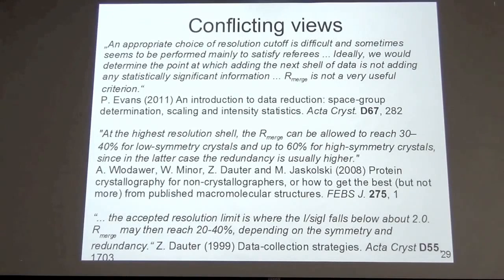Phil wrote not too long ago, R merge is not a very useful criterion. Very good. And the idea that he has is extremely good. Ideally, we would determine the point at which adding the next shell of data is not adding any statistically significant information. So we are talking back to the high resolution cutoff here. So he's proposing to check the next shell of data whether it adds some information. Very good idea.